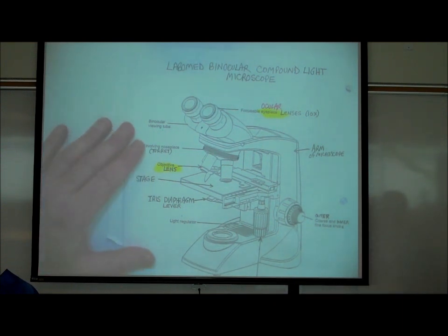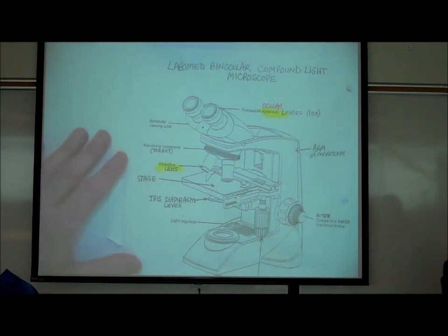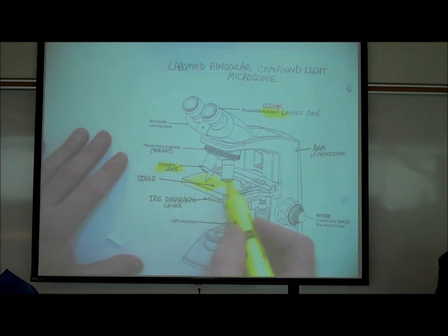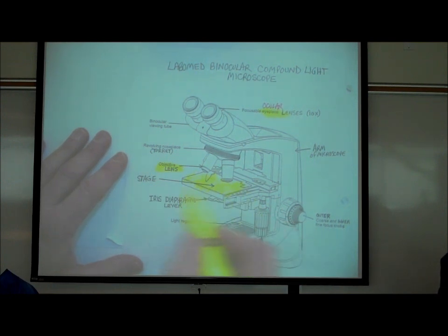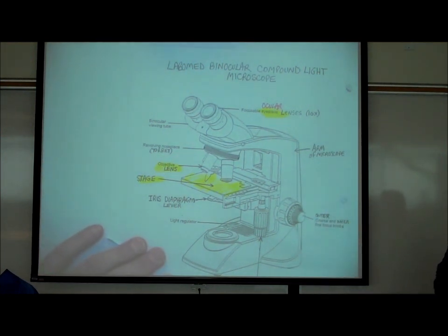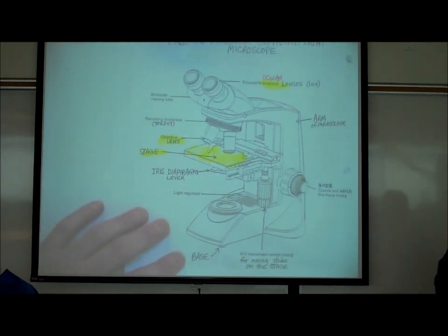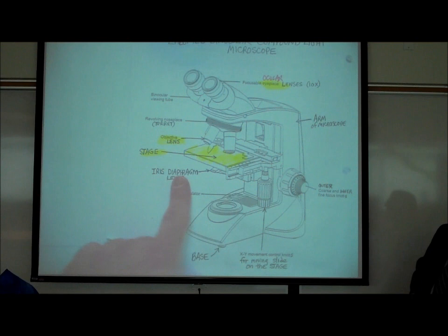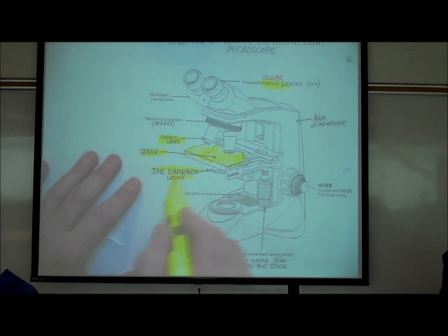You have four objective lenses. This flat area is called the stage of the microscope, and that's where you attach a slide. Right below the stage there's something called an iris diaphragm lever, which I'm going to be explaining.